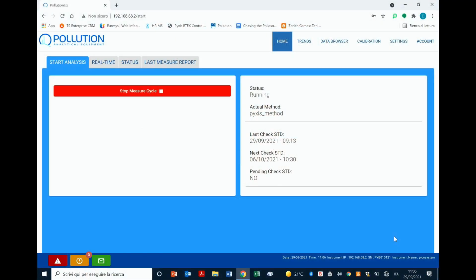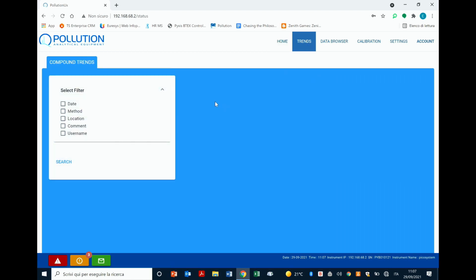In this video, I'll show you how to navigate through your chromatograms and enter all the historical data of the Pyxis. So you can click on trends, and here basically you see all the trend of the BTEX over a period of time. You can select different filters, for example, date, the method used, the location, or a comment that you add when you started the analysis.